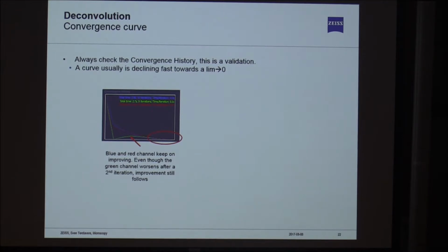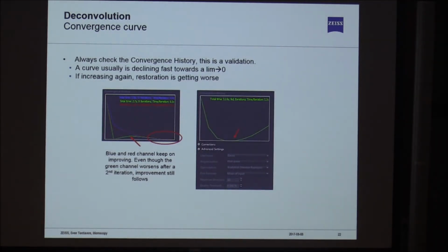And that's also a setting that you can choose, how much or how often I want an iterative process to happen. So instead of maybe 40 times, I would stop here at 10 times and then skip this last part. And still my image improvement will be very good. So that's what's shown here. This is a restoration which is going very well, and then suddenly it's going completely in the faulty direction. So then you have to set your iterative process value, in this case, to 10 instead of 20.